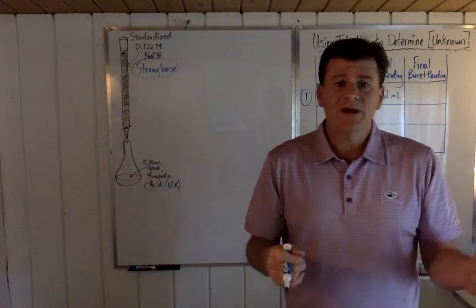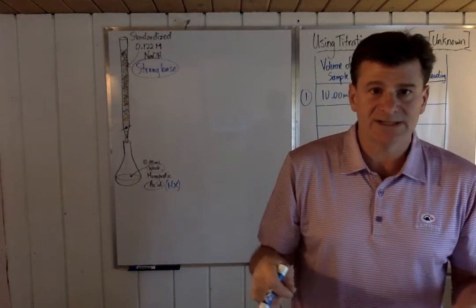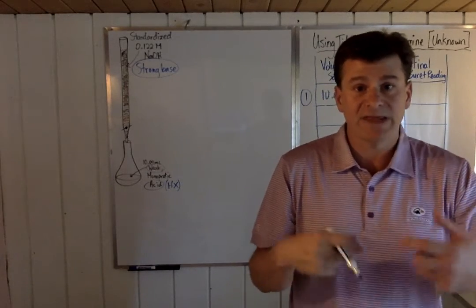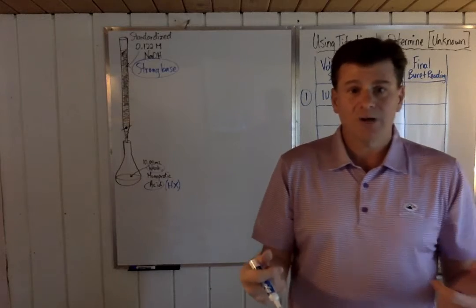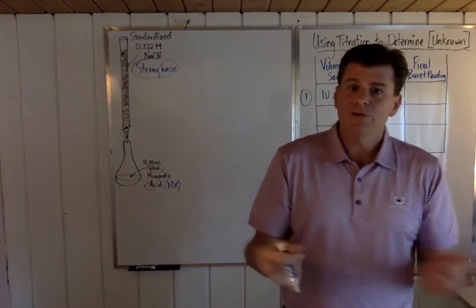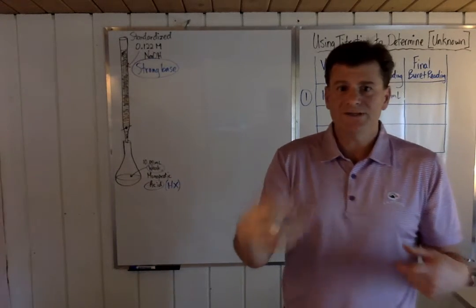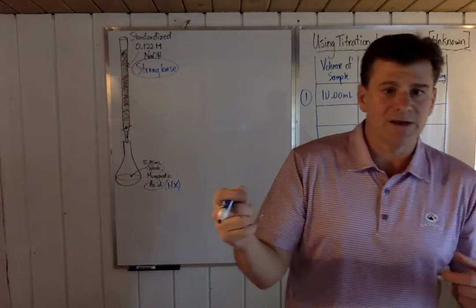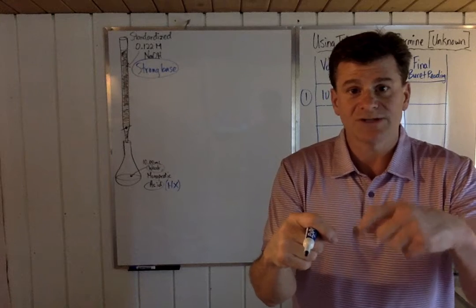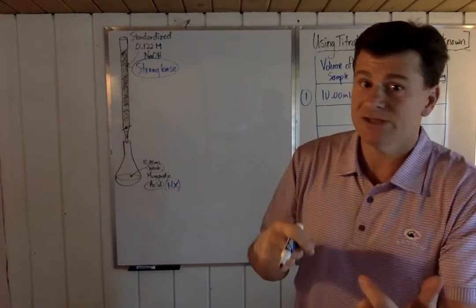Okay, now be careful, because if you sit there and you're swirling around trying to get that last little bit of pink to disappear, as you're swirling around, you're mixing carbon dioxide from the air. And when you mix extra carbon dioxide from the air, you're acidifying your solution. And so you're messing up your results, because you can create a false reaction between the carbonic acid you make by mixing carbon dioxide in there with some of the extra sodium hydroxide that was lingering, okay, when you weren't supposed to be doing that.